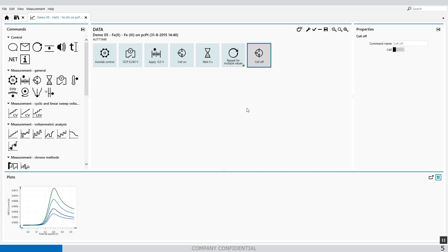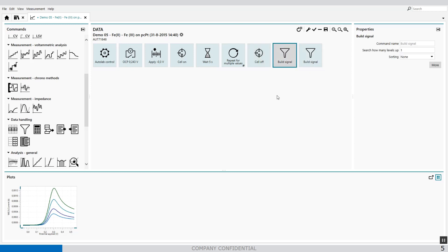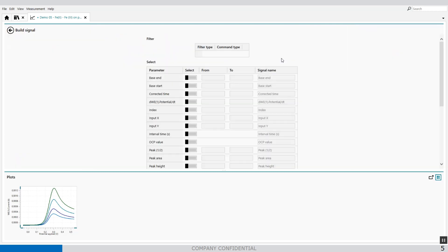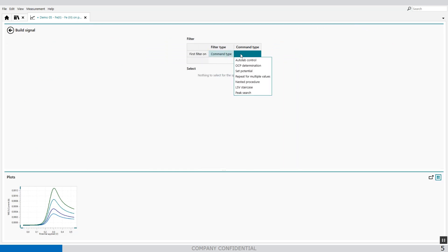What we have to do is to extract information from the peak search and the scan rate. First we have to find the build signal command, and we drag them twice behind the procedure — one is for the scan rate, and the other one is for the peak height. First we're going to extract the scan rate. This is done with the command type of the LSV, because the scan rate is available in the linear sweep full time tree staircase command.